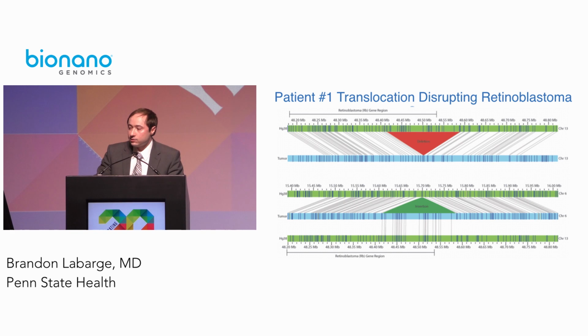The same patient had a translocation disrupting the retinoblastoma gene. You can see a deletion of part of the retinoblastoma gene on chromosome 13 that was inserted on chromosome 6.